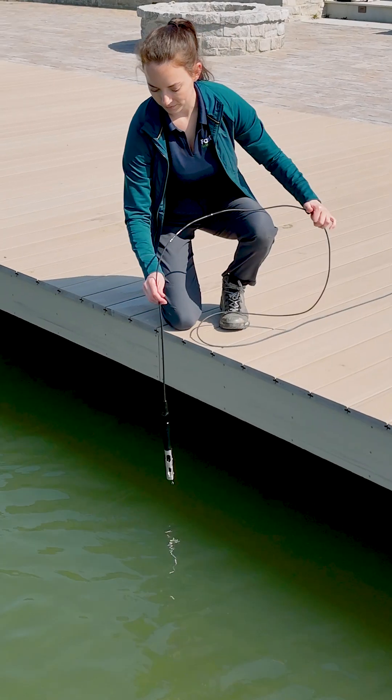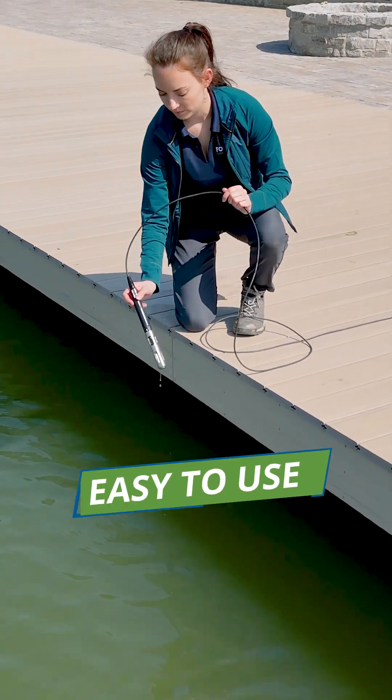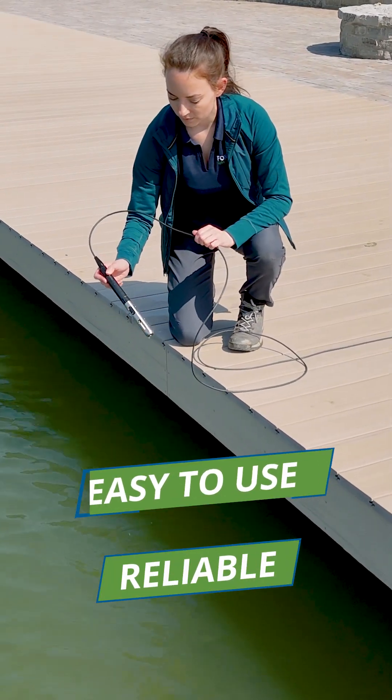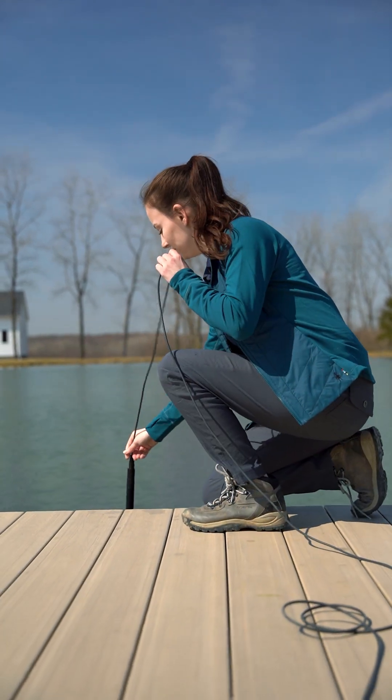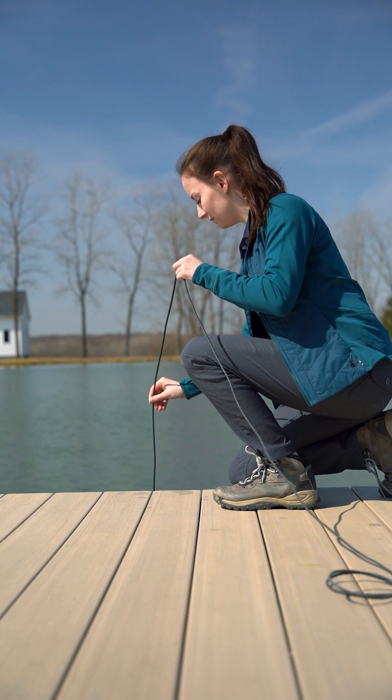The YSI ODO RTU is an easy-to-use and reliable dissolved oxygen sensor, and the preferred choice for fisheries, aquaculture, hydroelectric, and many more dissolved oxygen monitoring applications.